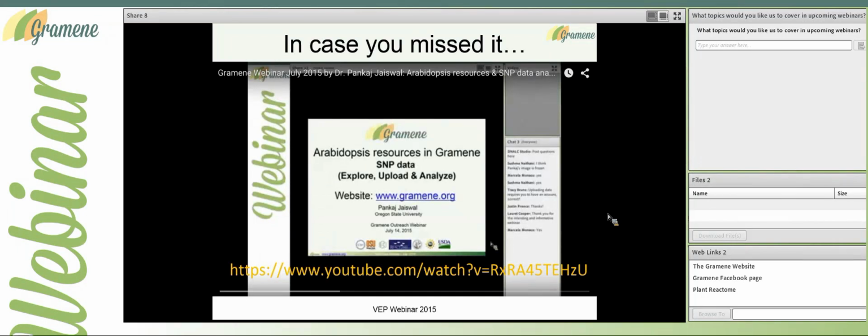Now, I'd just like to remind you that Pankaj Jaiswal did a webinar back in July of Arabidopsis resources in Gramene, looking at SNP data and using the website version of the Variant Effect Predictor. Now, this version only accepts up to 750 variants. The software that we will be using today allows you to have much more data.